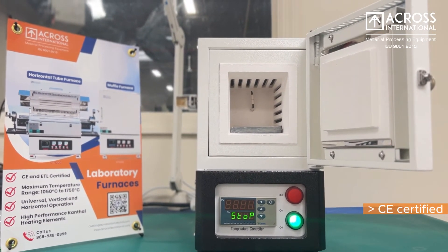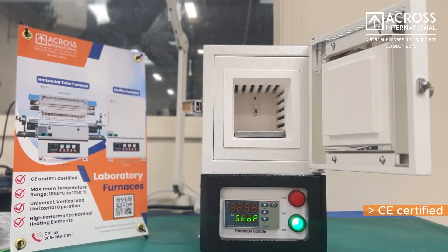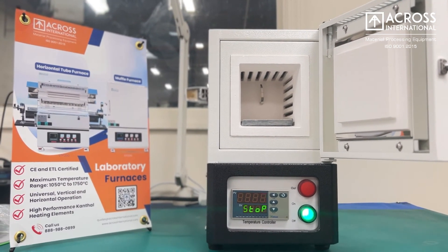All our furnaces are CE-certified and ETL-certified options for UL and CSA compliance.